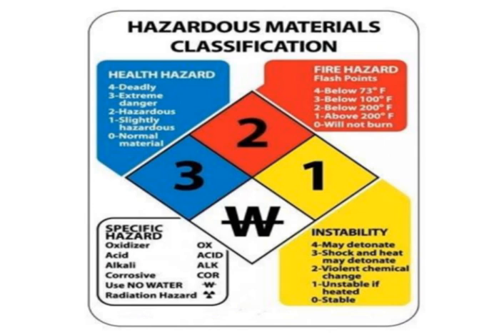Instability basically is about whether or not it will blow up. So like 4, it could detonate. 3, if you drop it and shock it, could it detonate? If you heat it, is it unstable or is it completely safe?